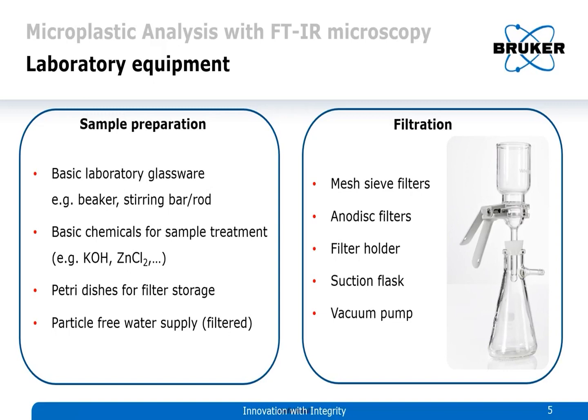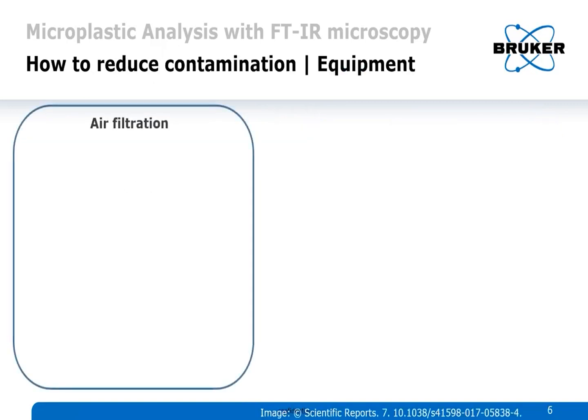What can you do to reduce contamination? What equipment is required? First, airborne particles are basically everywhere. So air filtration is very important.